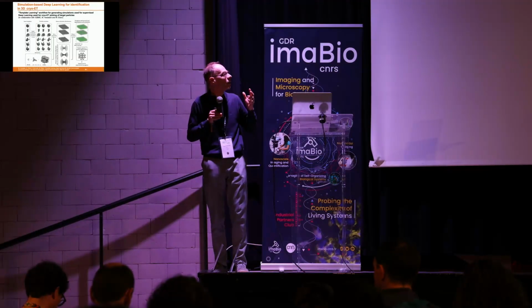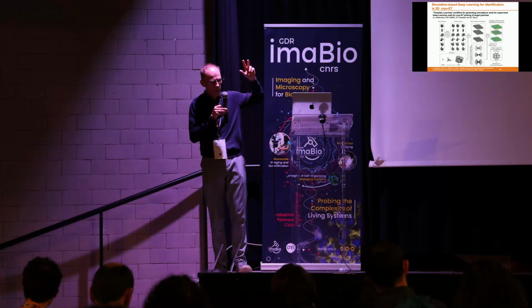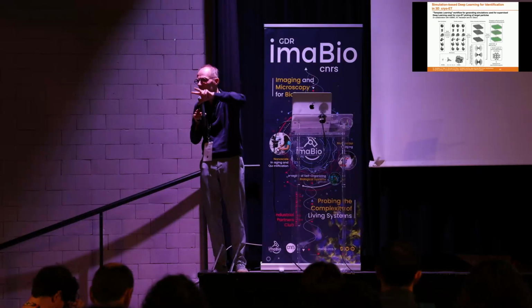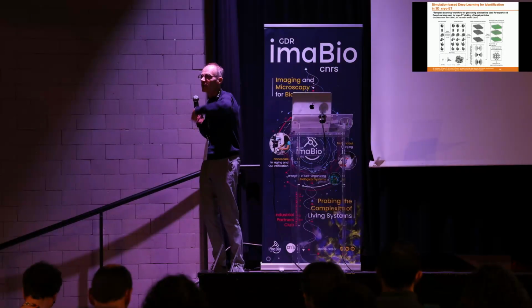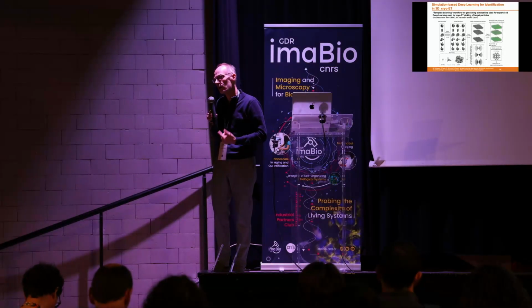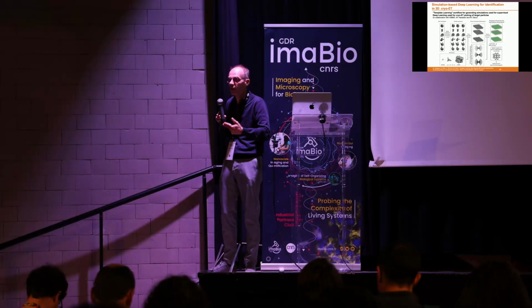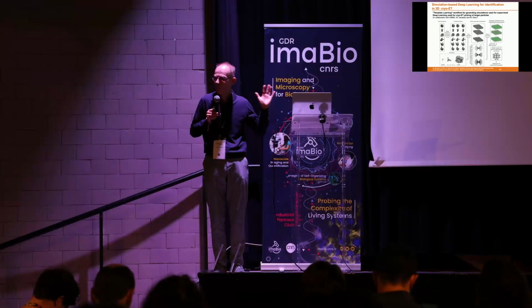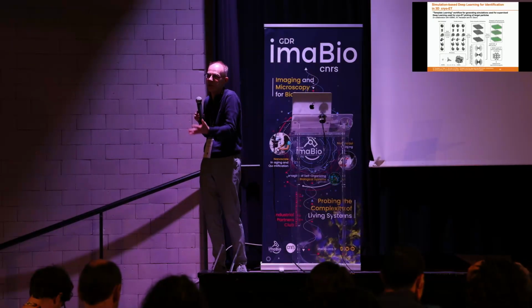Of course, given this, the outputs of the software on real data can help you maybe to better design how these particles are distributed in the future. So this is an iterative process, I guess. It could be that you can train how they are distributed. And for sure, for CNN, it's not appropriate for the time being to do that. So you have to resort to a classical approach based on spatial statistics typically.